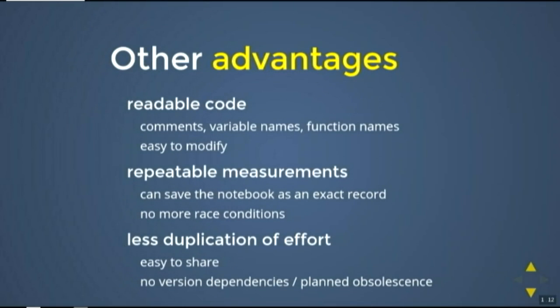There are a couple other advantages. Really, the main one is it's possible to read the Python code. I never thought named variables and named functions were a luxury until I started working in LabVIEW, but they are.